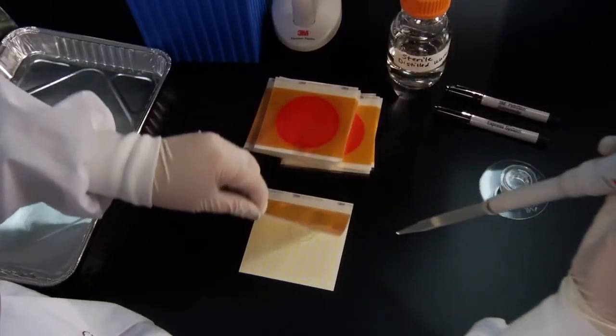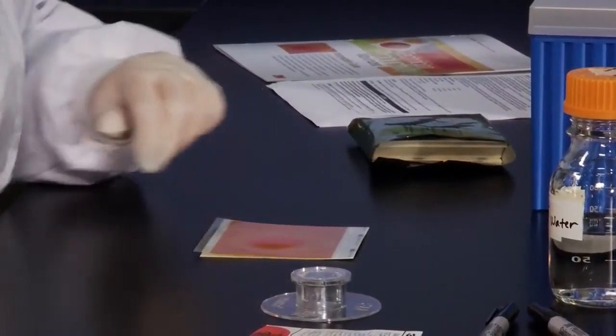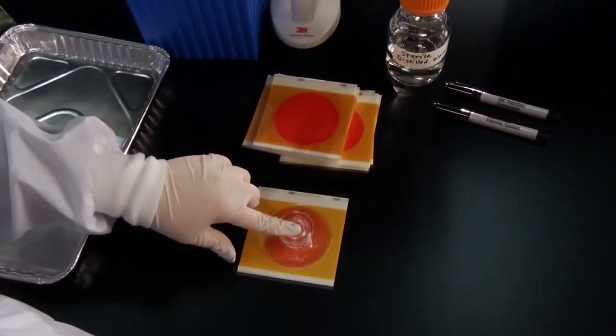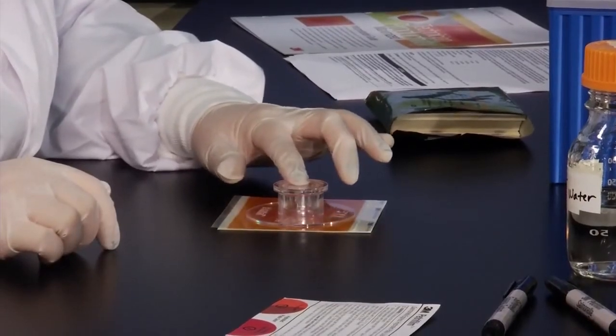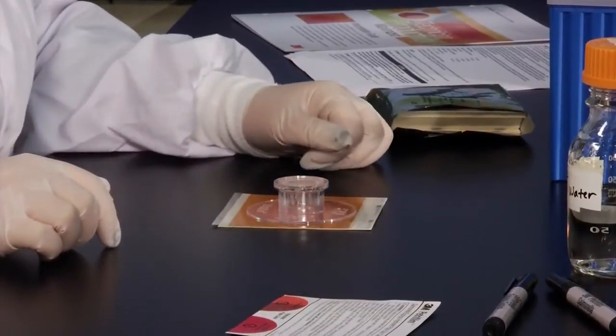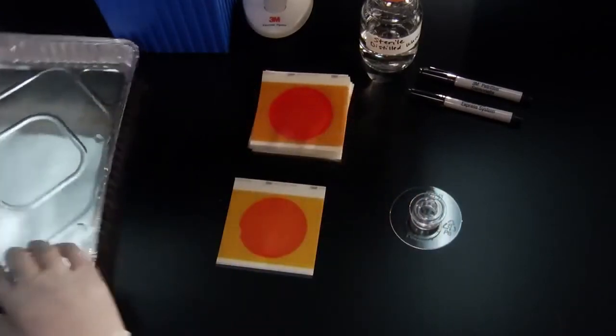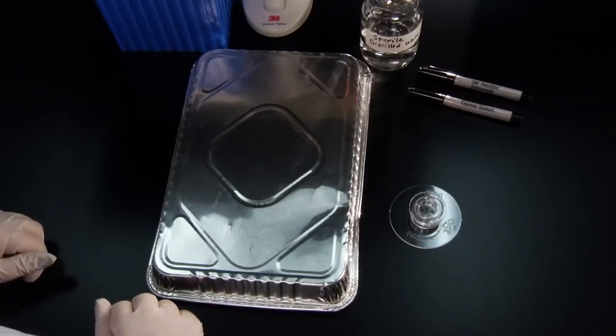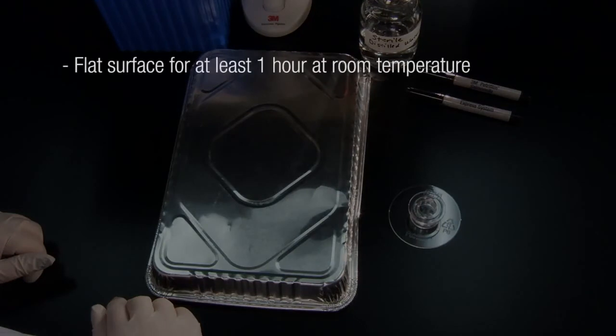Gently roll down the top film onto the diluent to prevent trapping air bubbles, and place the 3M Petrifilm Flat Spreader on the center of the plate. Press gently on the center of the spreader to distribute the diluent evenly. Remove the spreader, and leave the plate undisturbed for at least one minute.